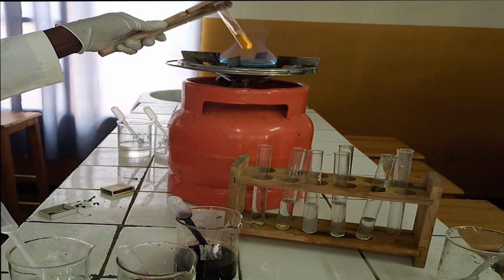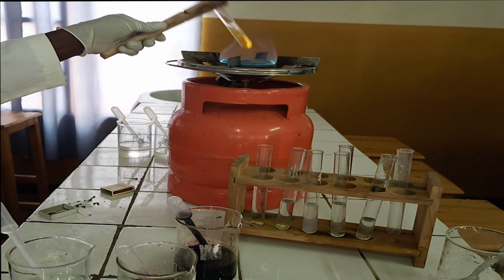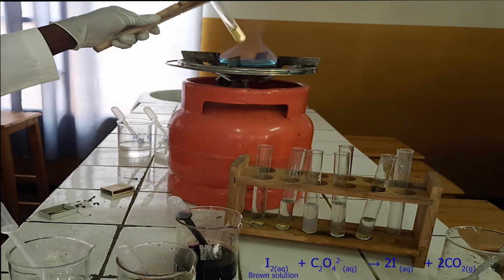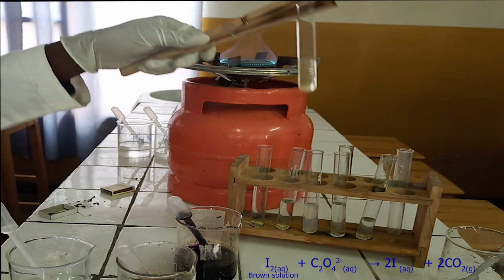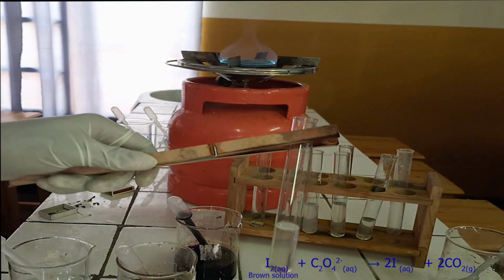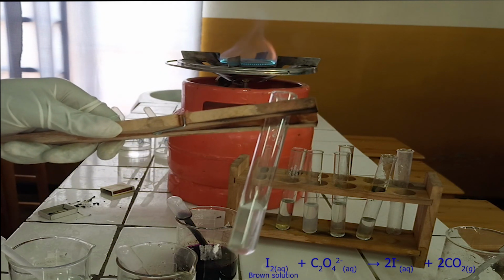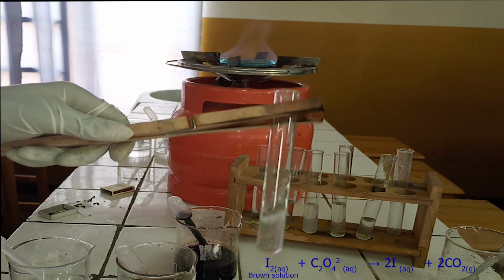As you see, on heating, iodine solution reacts with oxalate ion. During reaction, brown color of iodine turns colorless. Below, there is the ionic equation for this reaction.